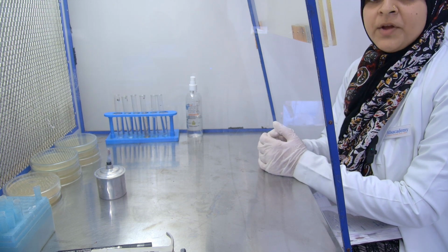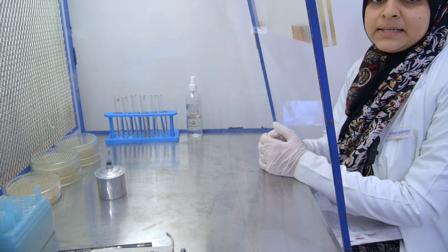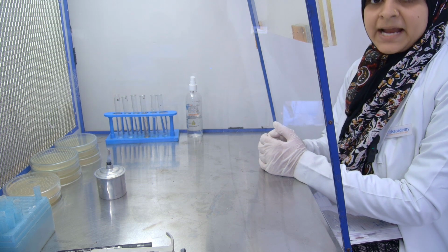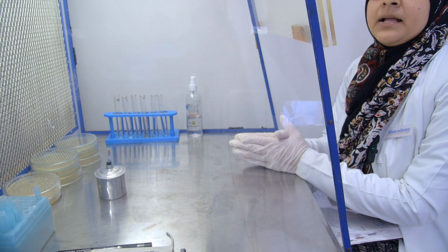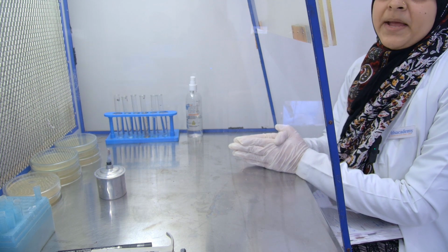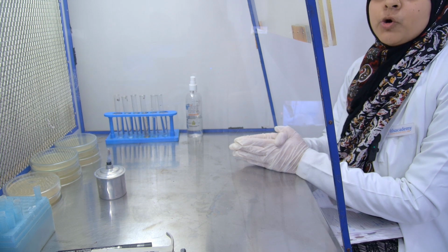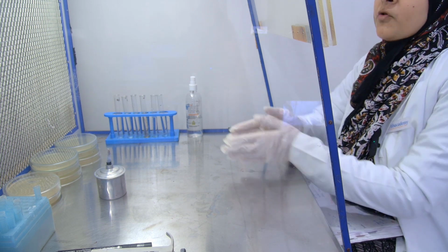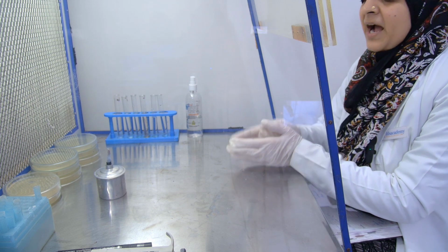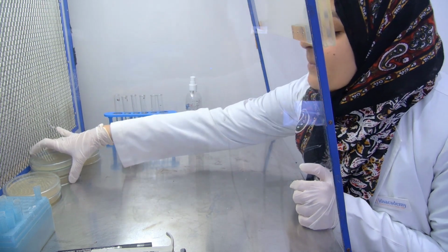Today we are going to perform another experiment in the series of microbiology techniques. The experiment that we are going to perform is the effect of temperature on the growth of microorganisms. For this experiment, first of all we prepare an agar plate.